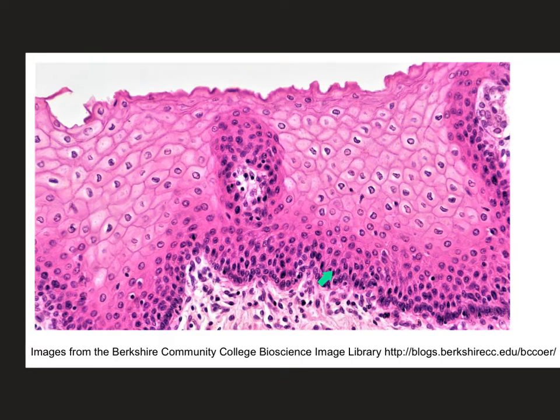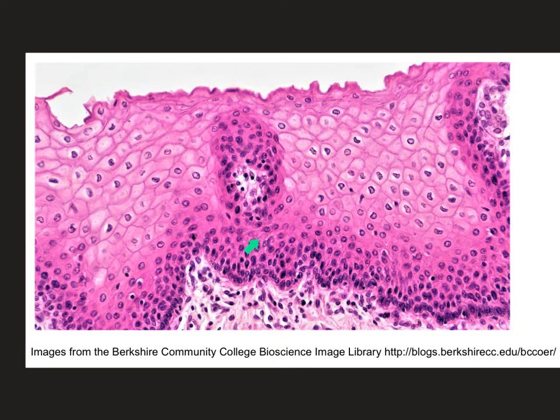You can see the many nuclei down near the bottom where the cells are much smaller, then the cells are larger as they move up, and all the way at the top you can still see cell structures and outlines but far fewer nuclei. This is indicative of what you would expect near an open surface of a mammalian system like skin — the cells at the top are already dead, providing protein, and the cells at the bottom are the ones dividing. This would be an example of a stratified squamous epithelial layer.